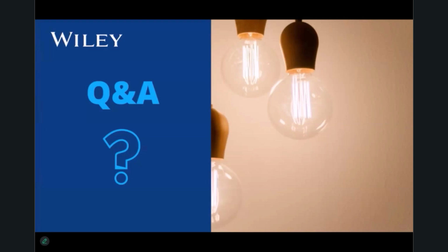How can you set up searches in KnowItAll to always include certain compounds in the hits? For example, I have an IR spectrum that I know contains cellulose and calcium carbonate, but may also contain one or more other compounds.